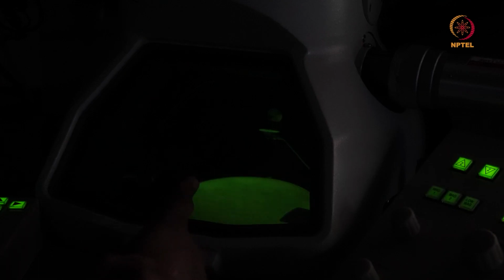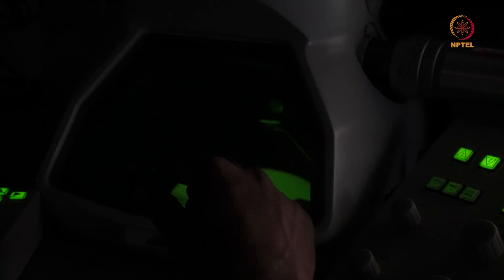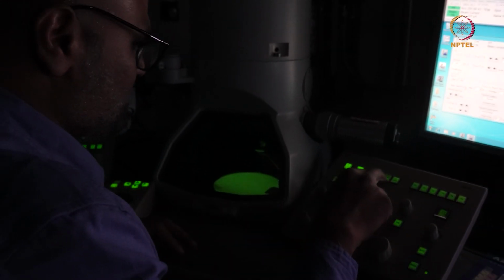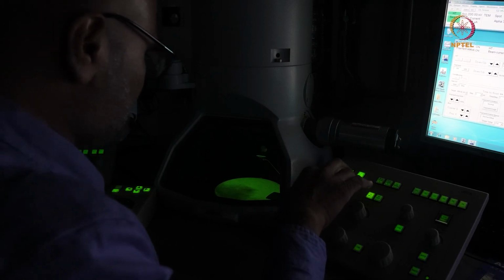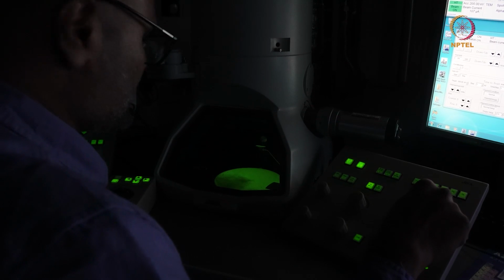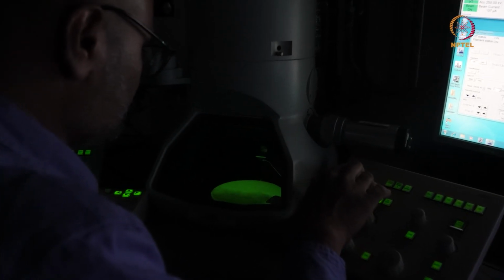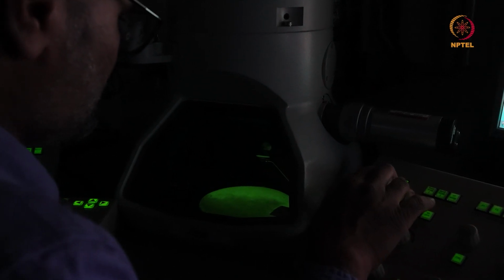Now as you can see here, I do not see a steady image at the center, because you are changing the lens voltages of the illumination lens that I showed you earlier. I can correct this by changing the height of the specimen. So before I do that, I have to click on standard focus here and then bring it to the center, and let me correct the height. So I'm moving downwards. It can be downwards or upwards.